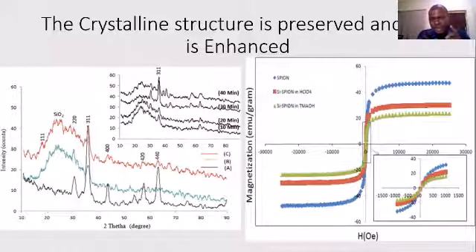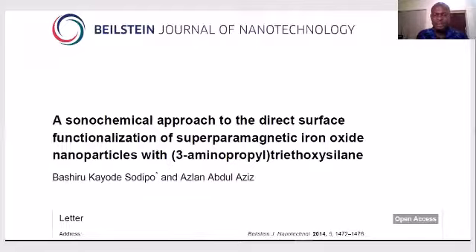one of the unique conditions of ultrasound can be used to incorporate different nanomaterial into another nanomaterial, depending on the type of application we want to use the work for. And then, successfully, we've also modified the surface of iron oxide nanoparticle. Let me show another work of ours where we use ultrasound to modify the surface of nanoparticle.